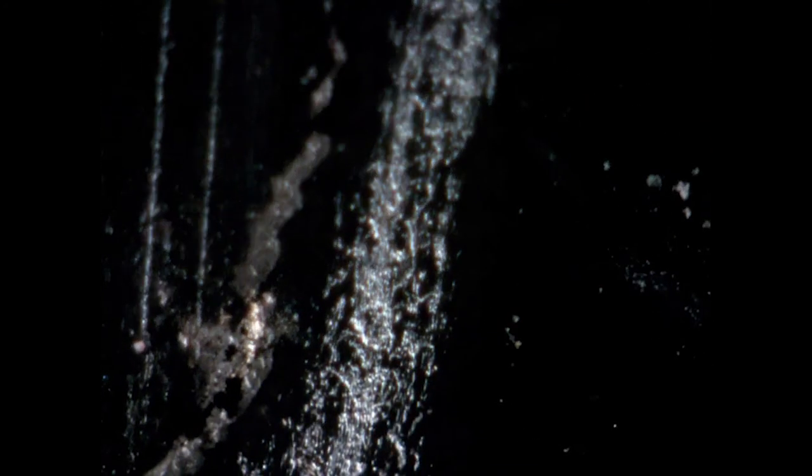In the last clip, which we're just about to come to, you see where the carbon is completely covered. It just absorbs all of the light, which is interesting in its own right. Just where that layer of carbon is, it's just taking all of the light. This is at full brightness. This last section, we're back to the dark area, what I call the honeycomb section.